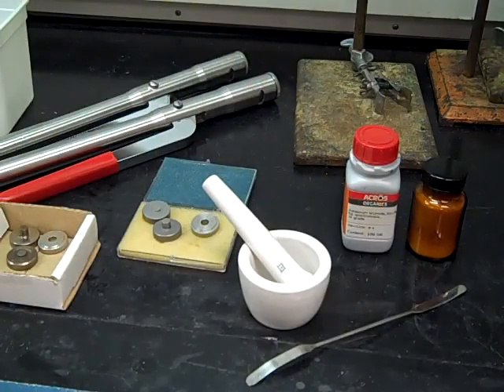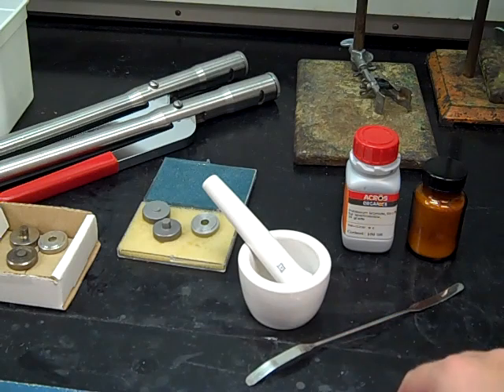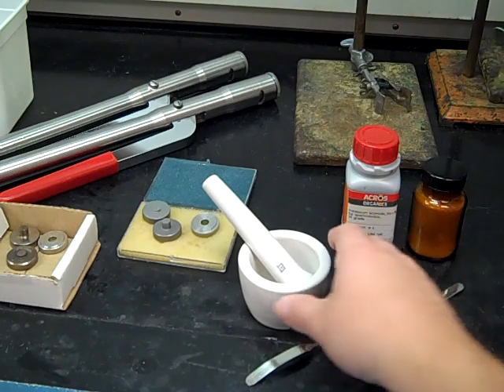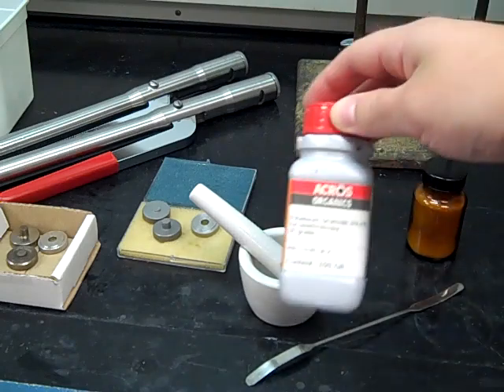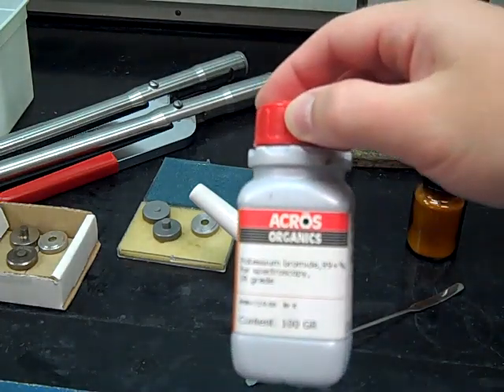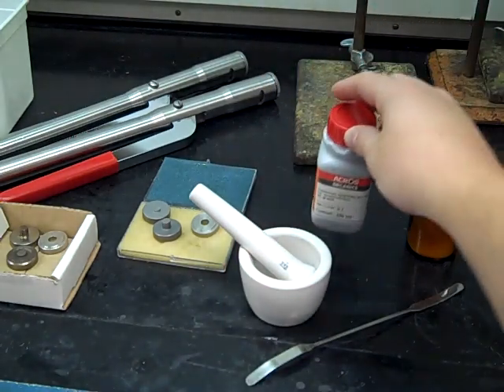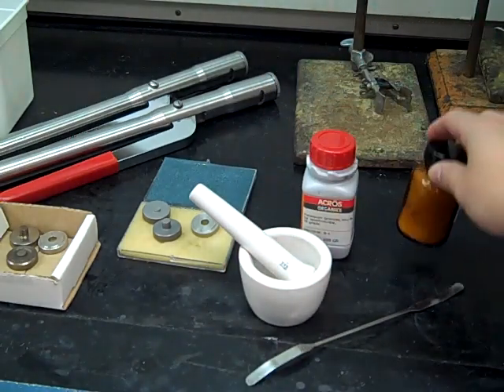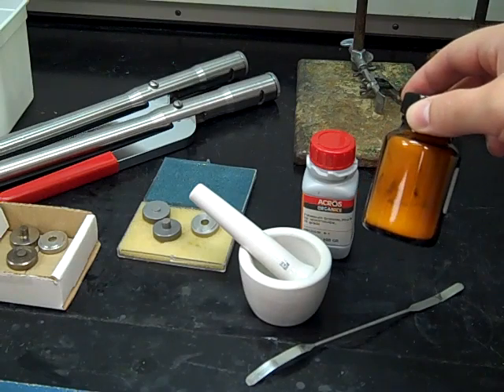Here are all the pieces that we're going to be needing for the solid IR sample preparation. We've got a spatula just to maneuver our solids around. We've got a mortar and pestle. We've got some potassium bromide, which is just a white crystalline salt. That's going to be the main component of our pellet. And we've also got a sample to analyze. In my case, this is salicylic acid.